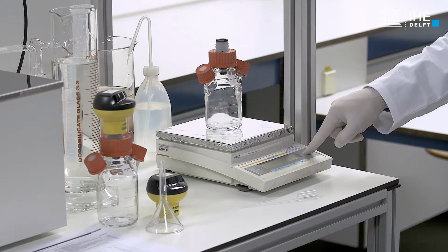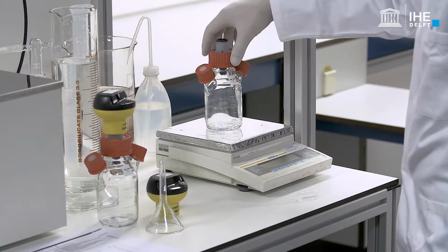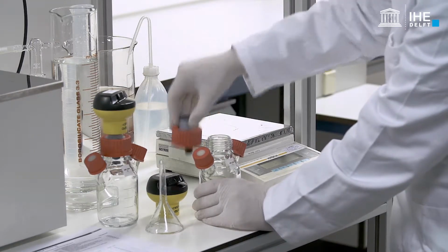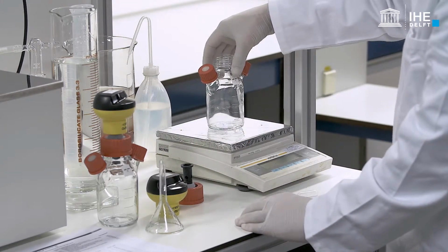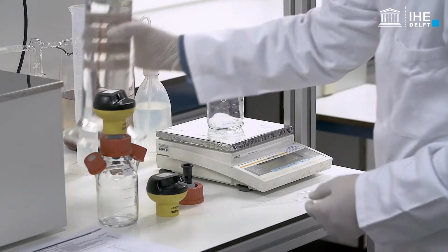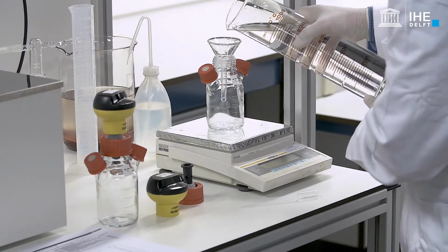The tare button is pressed to reset the weight to 0. Thereafter, the reactor is filled up with water up to the top.